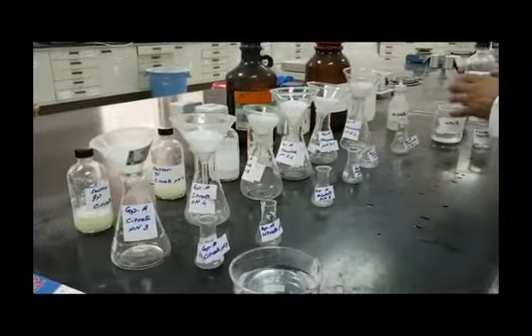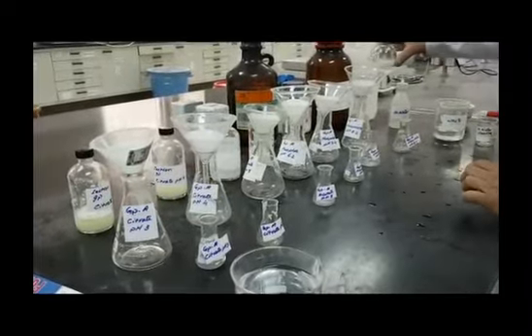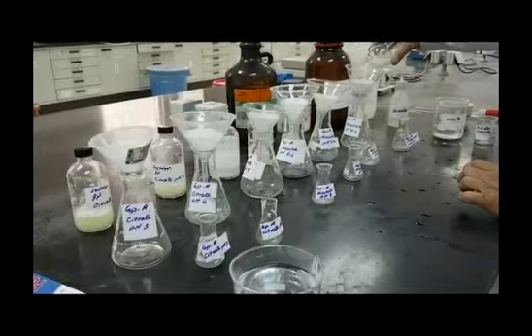Now, pour more volume on each funnel, again as labeled.